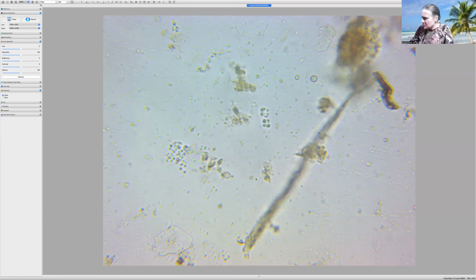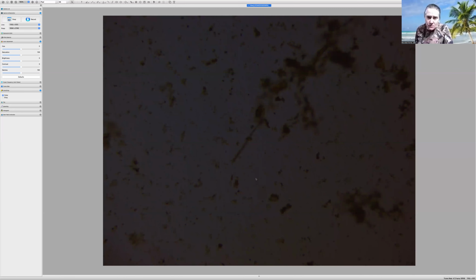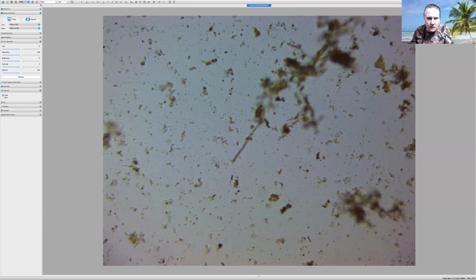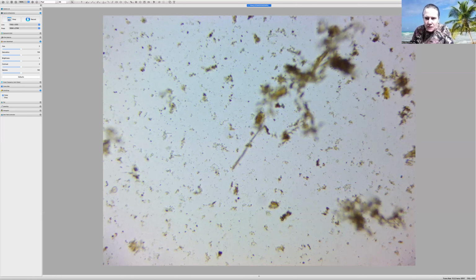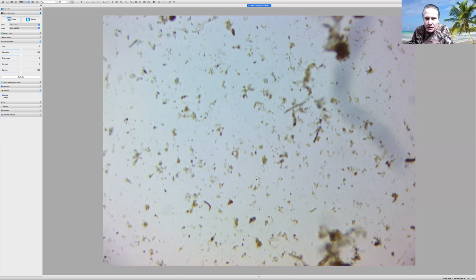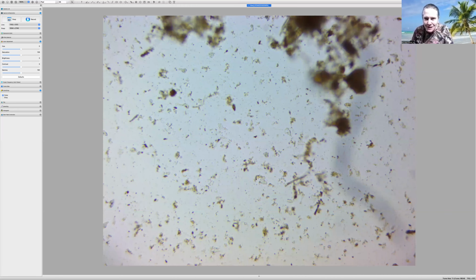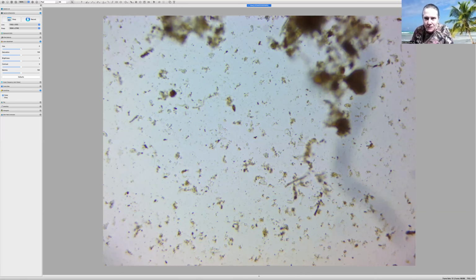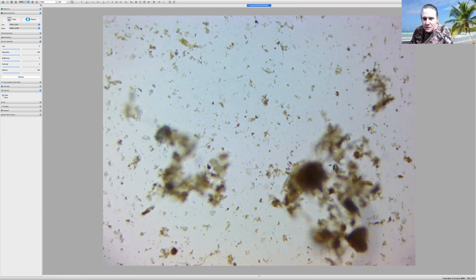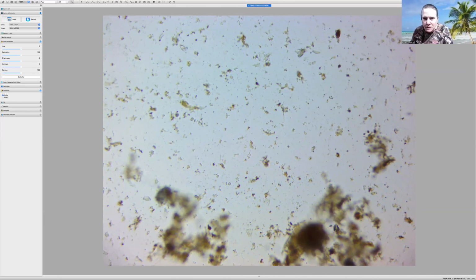So I don't think I'm gonna find one yet. Hang on, let's zoom out. Now, see, we're gonna be able to take in way more territory. Sorry, that was my hand. And I can find them pretty quick, because you just have to look for that vortex motion they got going on with the waters. And then if you can find them just hanging out on the edges, it's easier.